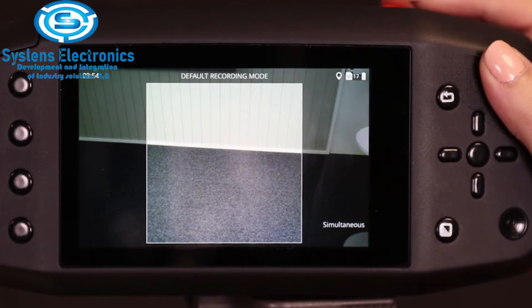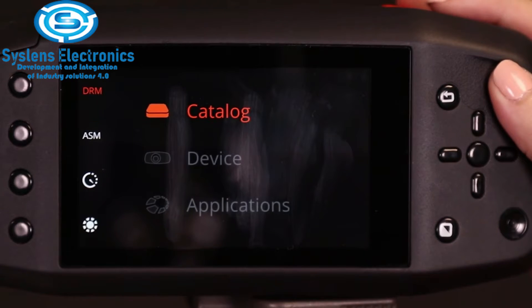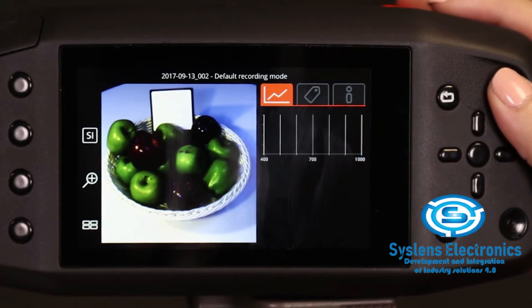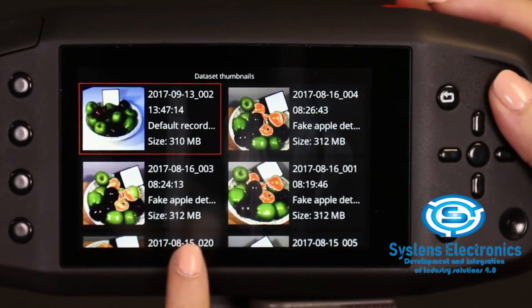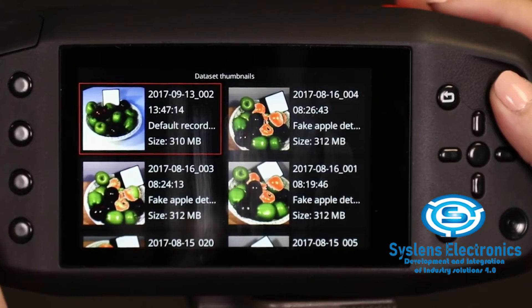To go to the catalog view, open the device menu with the Sets button. To choose catalog, press the button again, and the most recently recorded dataset will be visualized on the screen. From this view, you can press custom 4 to open the catalog thumbnail view, where you can easily scroll to see all of the data recorded on the memory card.